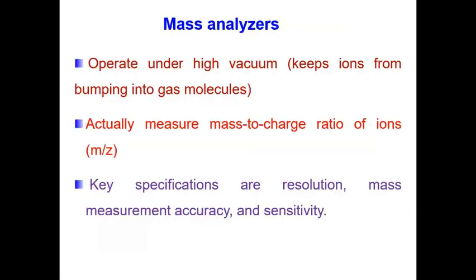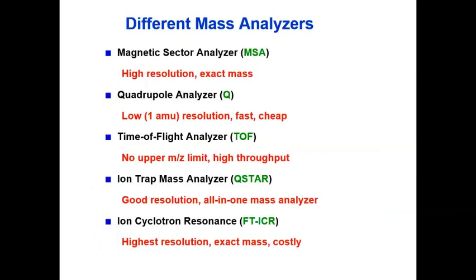Now we will study the different types of mass analyzer for analysis of a chemical substance. The use of a different mass analyzer will decide the resolution, mass measurement accuracy, or sensitivity.